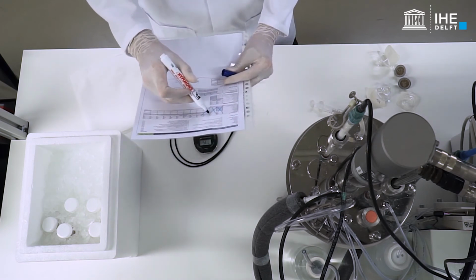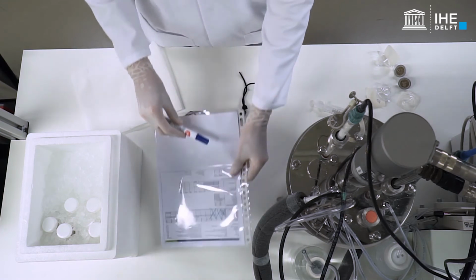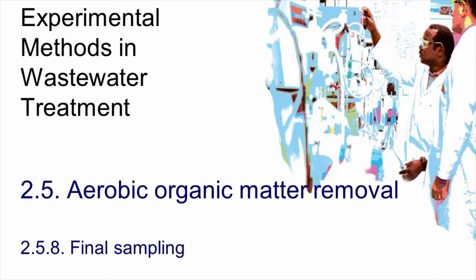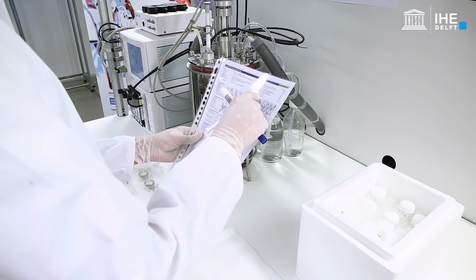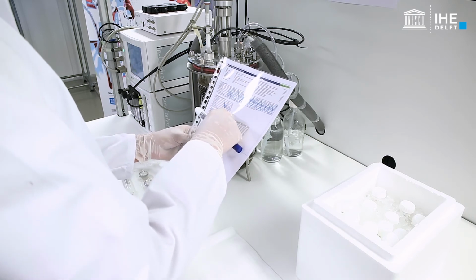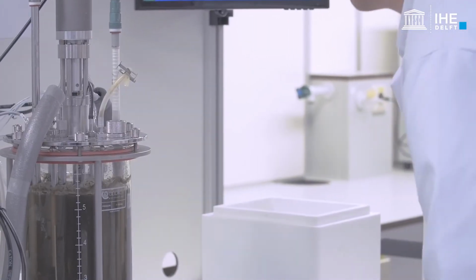Thereafter, continue with the sampling program for soluble and particulate compounds as planned and described in the working sheet. Throughout the test, confirm that the required operating and environmental conditions have been stable and within the allowable operating ranges.